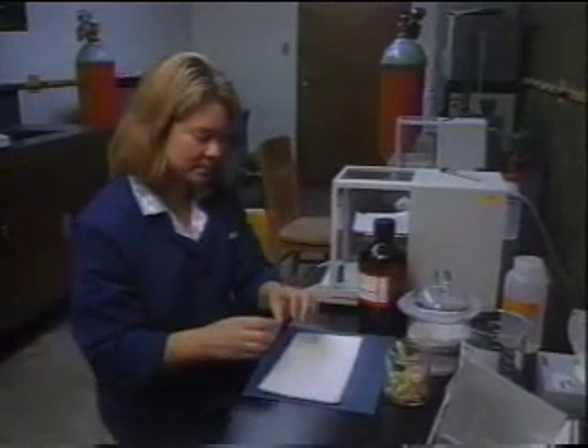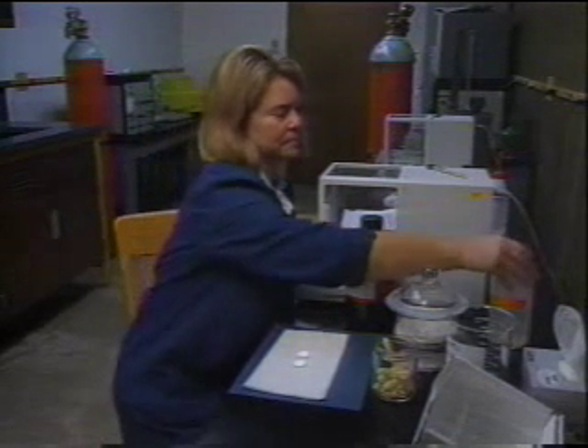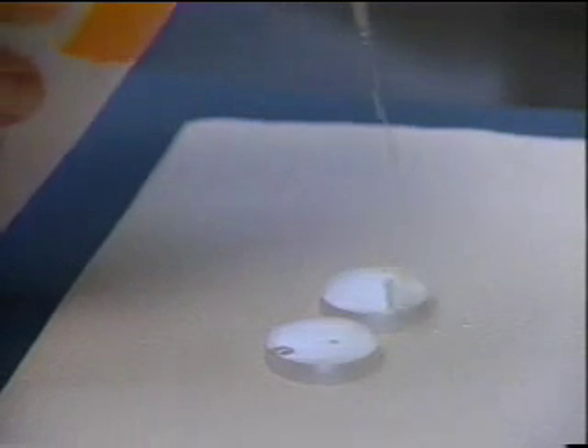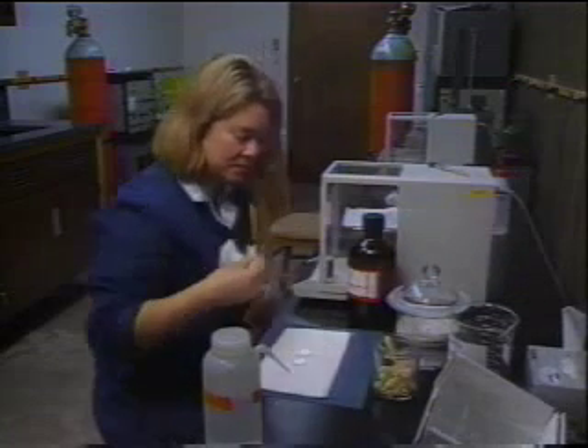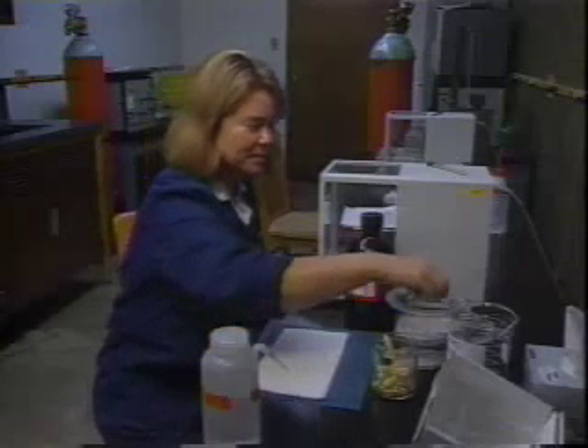To clean the plates, open them up and place them with the dirty side up on some paper towels. Squeeze a little methylene chloride onto the tops of the plates, then wipe them with a KimWipe. Never use water or acetone to clean salt plates. Place them back in the desiccator for storage.